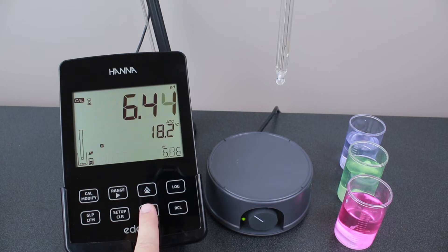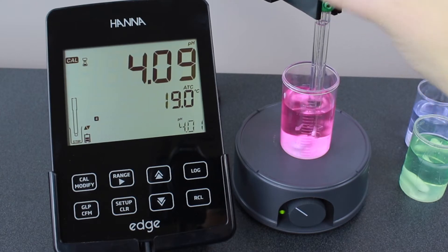By default, the meter asks for pH 7.01 buffer first. Use the arrow keys to move the first calibration point to pH 4.01. Then place the electrode into your buffer.